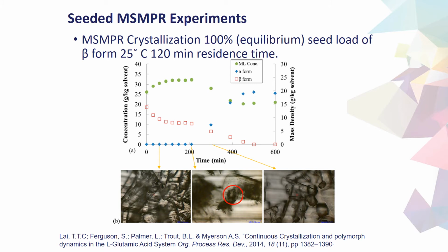So going to a steady state and seeding with an alternate polymorph to see if that will go on to dominate, or as in this case, at the most extreme case you can do, of a very high above 100% seed loading, and allow the crystallization the opportunity or enough time to self-correct if it has the tendency to do so back to the original steady state at which you've selected for manufacturing.